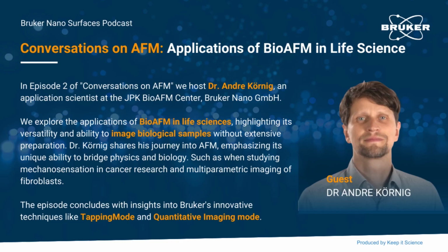What we realized, and this is a bit of what we said, is that we want to make it more simple. It's quite an easy mode to use because it doesn't have many parameters to adjust. You just have two or three parameters that are quite intuitive. You have a set point, meaning how much force you apply while you go down, and a z-length, how far you go up.